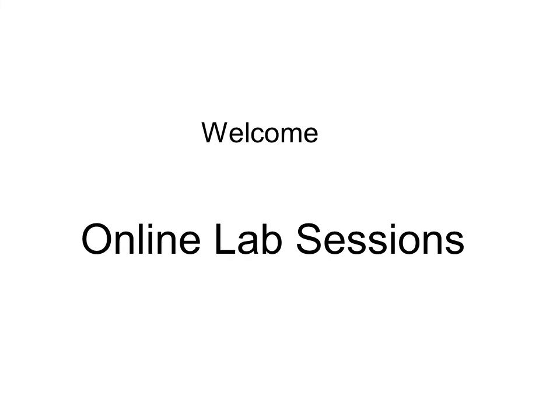As promised in the previous lab class, we are going to continue with more experiments. Today, again, I'm here with another experiment to carry on with. In the previous class, if you have watched, we carried out an experiment with a ketonic compound. It was acetone, and we carried out our experiment with that compound and got our desired results.